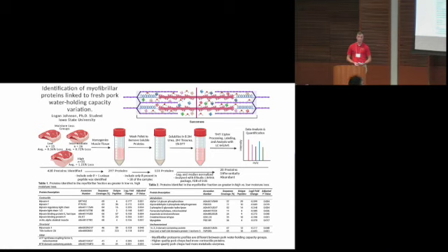When you filter from about 297 proteins to 133 proteins using the cutoff of if they're present in about 38 samples, or greater than 38 samples, does that mean that you lose the ability to determine if there's a peptide present or a protein present in specifically just a slice of your groups, your categorizations?